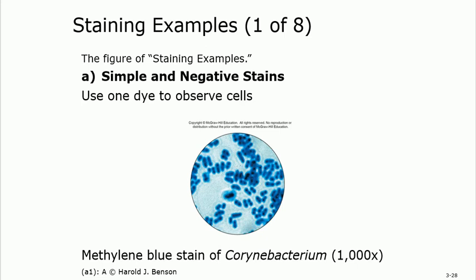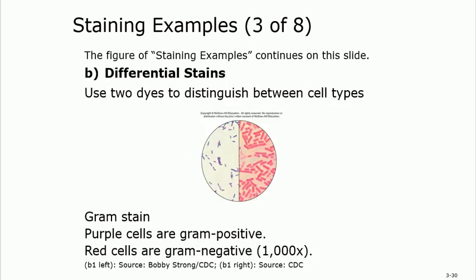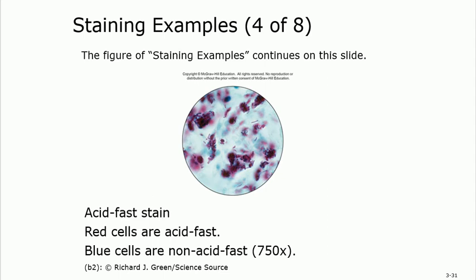Here is an example of the simple stain, and this is an example of the negative simple stain. This is the differential stain — you can see different parts showing: the purple ones are gram positive and the red ones are gram negative. For gram stain, a primary stain is used; organisms that take the stain appear purple and are called gram positive, while those that don't take it appear red and are called gram negative. When we study actual organisms you'll see the significance, but generally: positive takes purple, negative takes red.